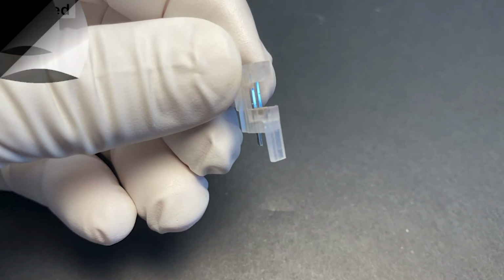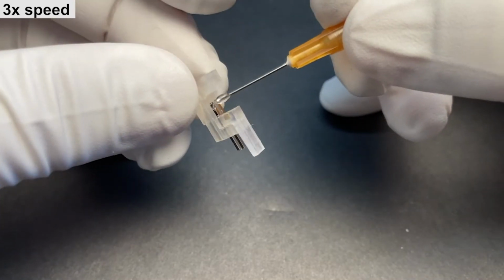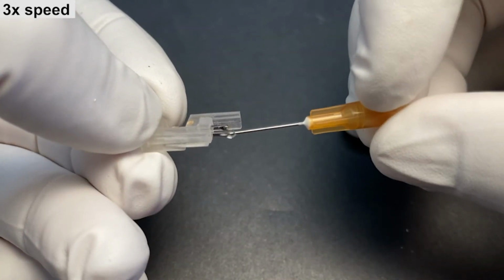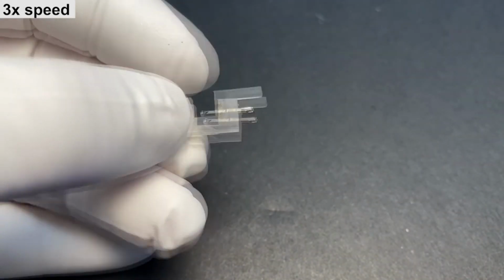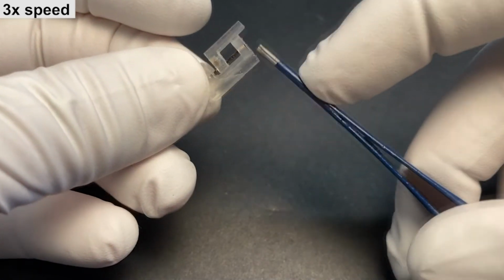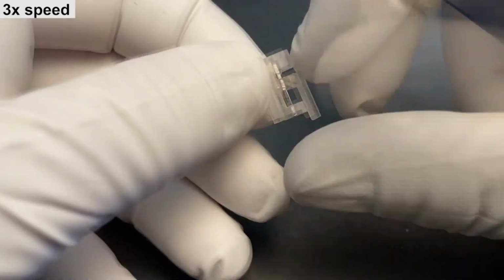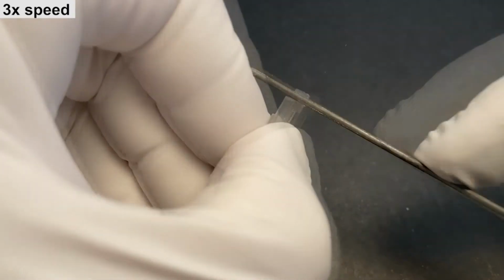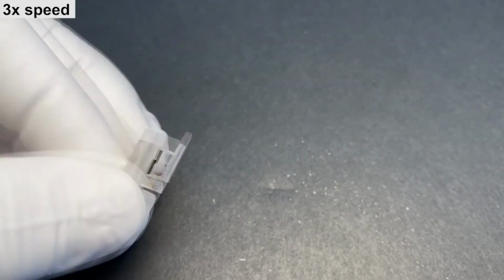So you can see here the removed metal bars, and then you can apply a small amount of super glue or any kind of glue that you like to use. And then you just push it in. And once the glue has cured, you need to remove any excess metal and glue from the base of the drive, because you want to have an even, flat surface.